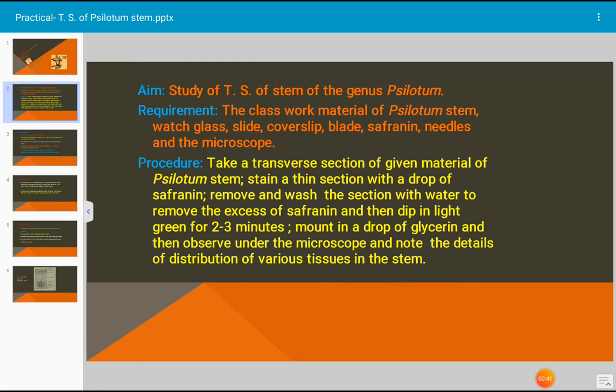In procedure, what we have to do is take a transverse section of given material of Psilotum stain. Take many sections and select a very thin section. Stain the selected section with saffranine, remove and wash the section with water to remove the excess of saffranine, and then dip in light green for 2 to 3 minutes.